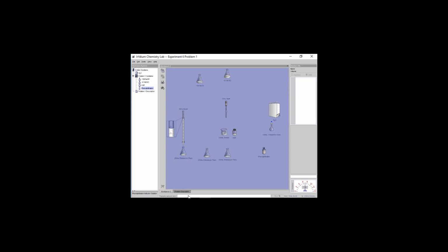In this solution here, maybe I'll transfer 1 mil at a time. On my second trial, I'm going to be a little bit more precise as I get closer to the final volume. Let's say I transfer it 1 mil at a time. I basically open and close the stopcock valve. So I transfer it in here. You're going to see this number on the side continue to drop. I dropped in 1 milliliter. At first, it may have turned pink, but there definitely was enough acid. The acid kills off all the base. Overall acid, the indicator is still staying colorless. So I keep transferring the solution in. Watch this volume drop. So the burette volume is dropping. Again, the first one is a little bit sloppy. And okay, so now I've hit a pink color. I probably overshot at this point. I would still take down this reading so I know approximately what it is.